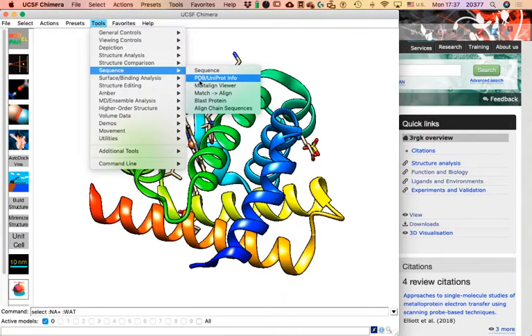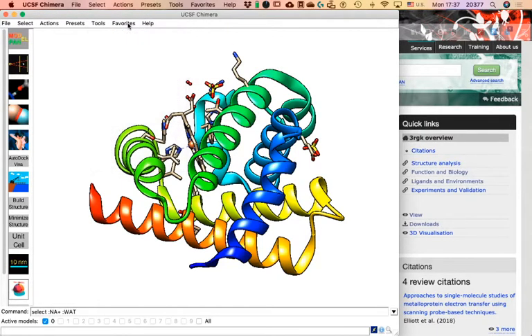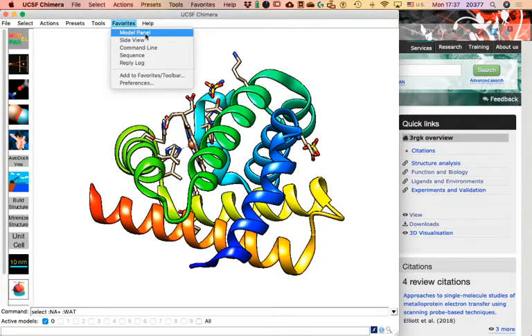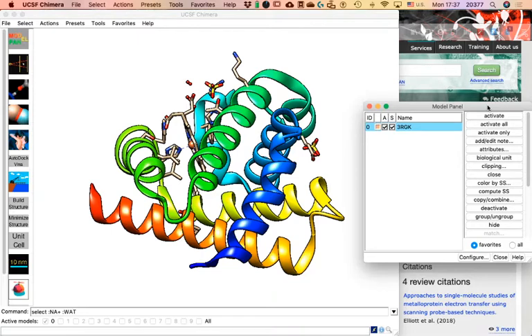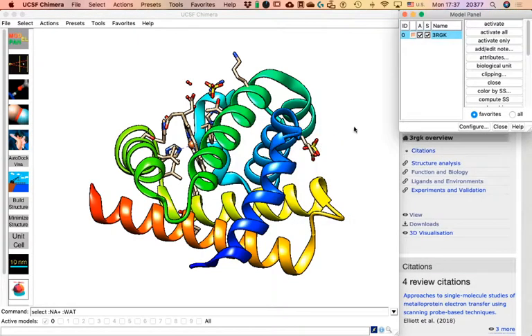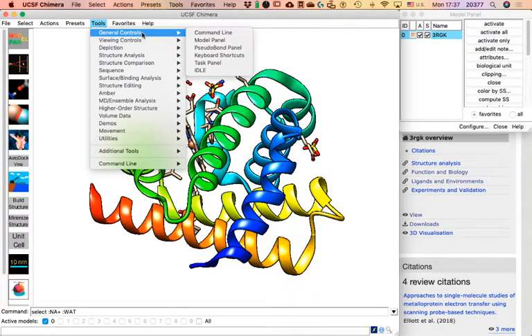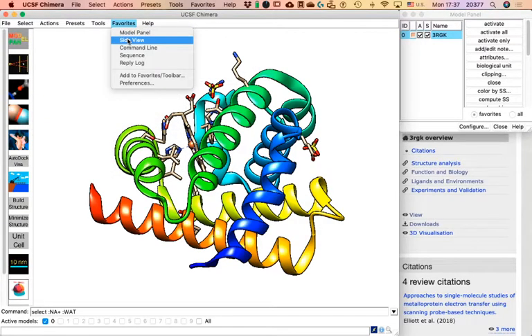I want to show you Favorites — it's like the name describes: in a browser these would be your favorite websites, but here these are functions found in Tools or any other menu that you want quick access to. For example, the Model Panel. I'll click on it — we now have the Model Panel. It can also be found under Tools > General Controls.